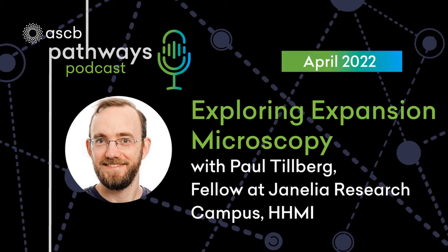Well, one way that you can improve the Z resolution, meaning along the axis of the microscope, which is the worst resolution. You get much better resolution in XY, you get worse resolution in Z. So that's one way, depth of field? Yeah, that's right. So that's always at least 3 times worse than your XY resolution, even for the most powerful objective lenses. And for less powerful lenses, that ratio becomes even worse.